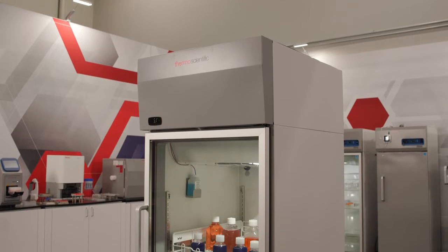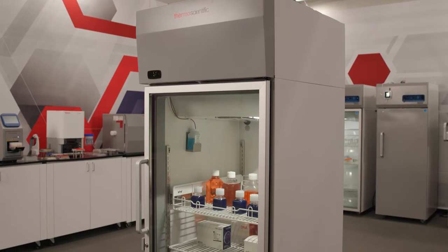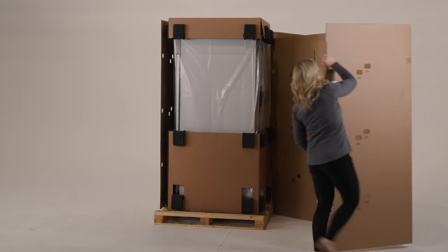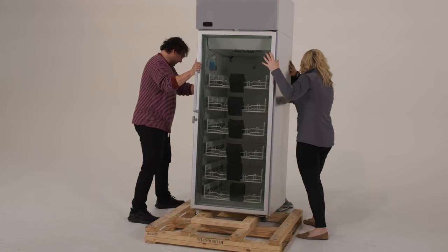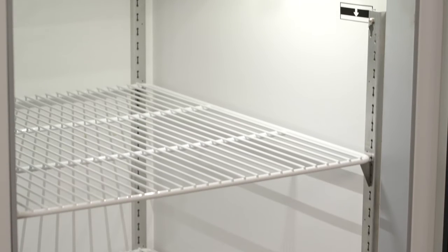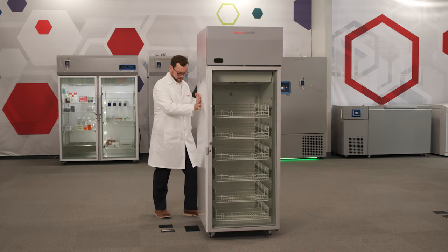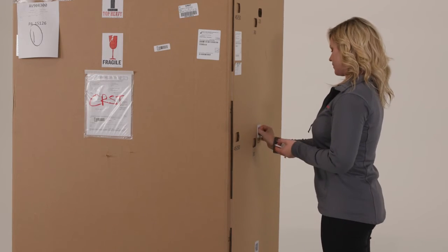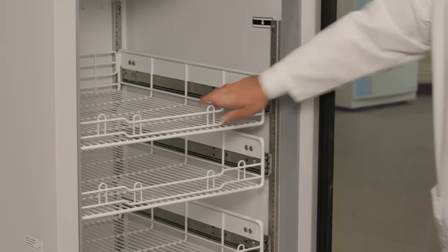Learn how to start up your new Thermo Scientific TSG laboratory or pharmacy refrigerator. First, unbox your refrigerator, remove it from the pallet, adjust shelves or baskets, and put it in place. View the unboxing video and the shelves and baskets video for more detailed instructions.